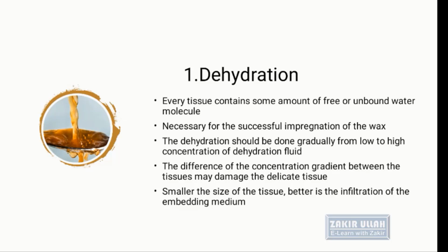because when there is direct contact with a high concentration of dehydration fluid, because of this difference in the concentration gradient, the tissues can be squeezed and their size can shrink. The smaller the size of the tissue, the better is the infiltration of the embedding medium.